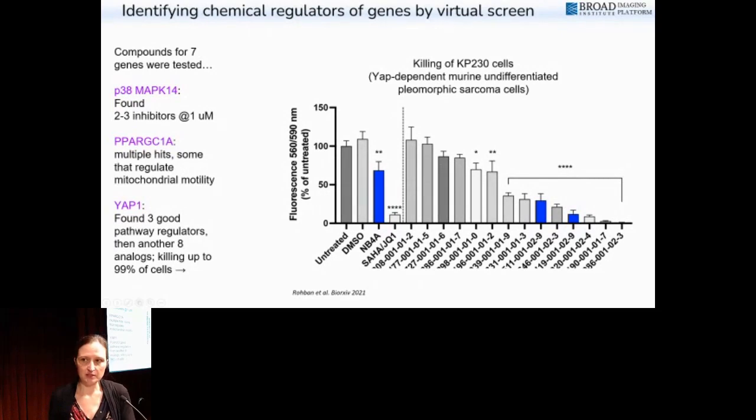And so it's absolutely the case that this is not going to yield super specific inhibitors of just that one protein. We do have some confidence that it probably doesn't hit a lot of different things, because if it did, it would yield a fuzzier profile that would not match YAP1 so well. So in that sense, it's maybe a bit more specific than you might otherwise think, but it's by no means a guarantee. So for these kinds of compounds, you still want to check and figure out what exactly is the direct target, and are there any off targets that would be of concern.